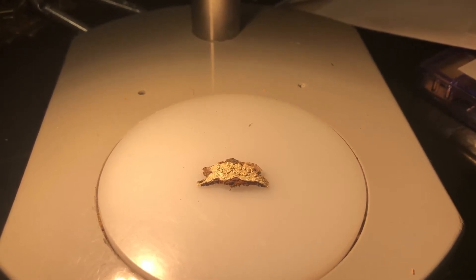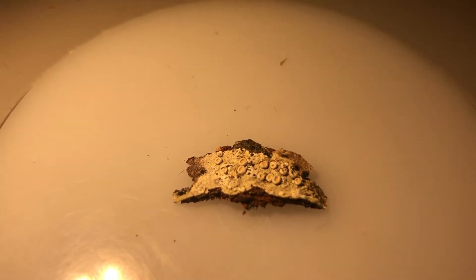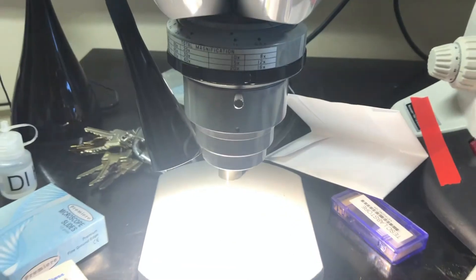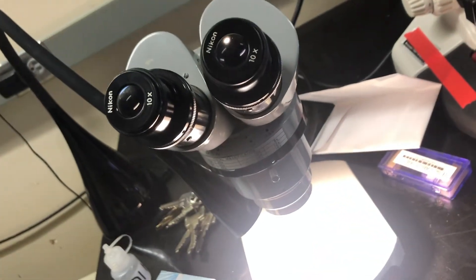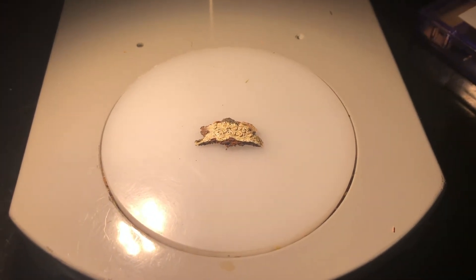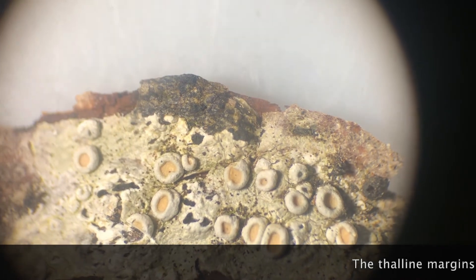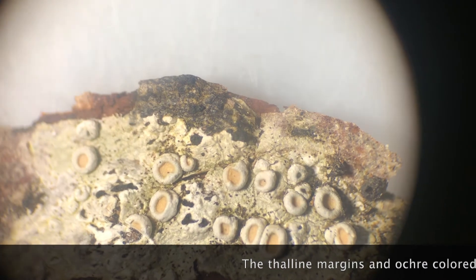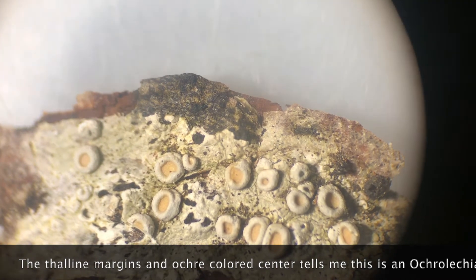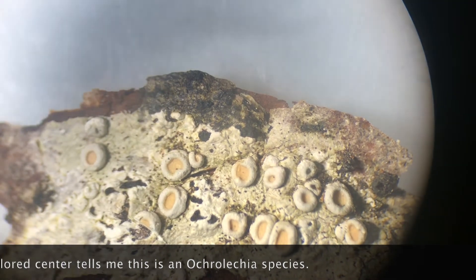Underneath the microscope I have a small sample of bark with the crustose lichen on it. I recommend setting this onto the stage of your dissecting microscope to begin. At about 40x magnification you can see the little apothecia with the thalline margins and the ochre-colored center. That's where we're going to be cutting through each of those apothecia using our razor blades.